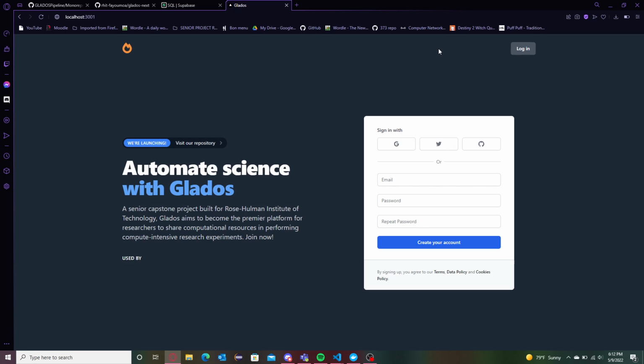This video is on how to actually use the system. Hopefully by now you have already seen the video to get it set up. Like I said, now that you have it set up, you no longer have to do it again. So, we're going to start off from the home screen like so.